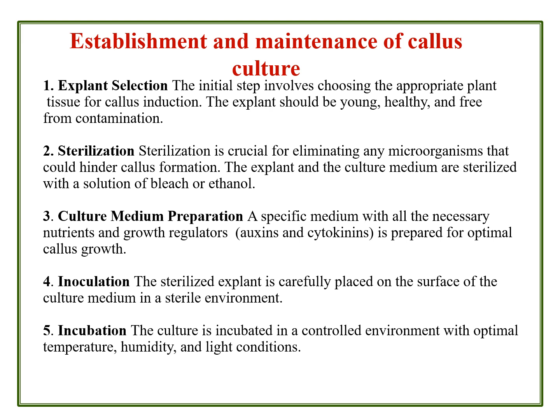The students must always sterilize, petri plate to petri plate, aseptic operation to aseptic operation, with 75% ethyl alcohol to avoid contamination, and then comes inoculation. The sterilized explant is carefully placed on the surface of the culture medium in a sterile environment. Of course, at the same time the culture material is also taken to the laminar airflow chamber where the culture material is surface sterilized.